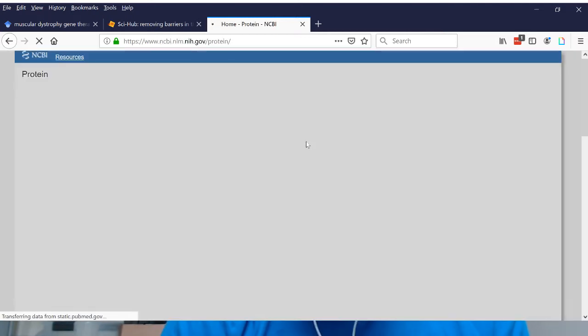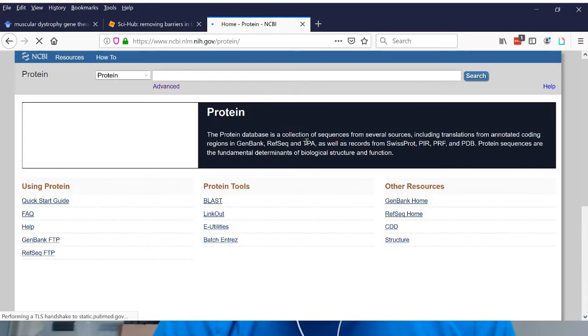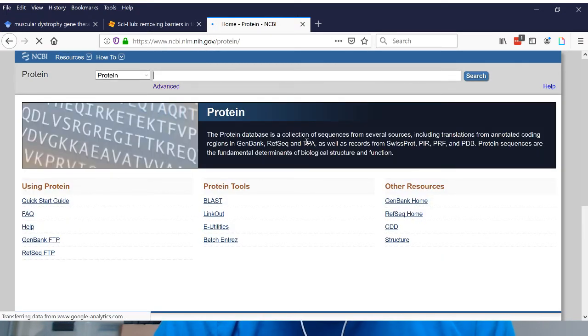Even though we're trying to get a DNA sequence here because we want to create a genetic engineering for our organism in some way, we want to get the protein sequence. Remember, we talked about the protein is really what's important. The DNA sequence is basically just telling us what protein to make, and then the protein does all the hard work. So for us, the protein sequence is the most important, not the DNA in this case at all. So we want to look at protein sequences.